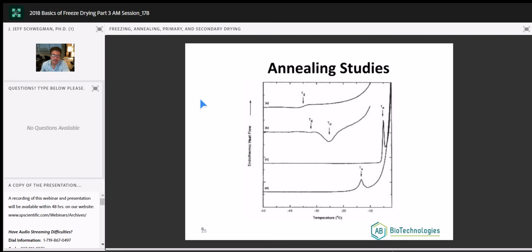On the DSC, if you recall from last time, very classic glass transition temperature, Tg prime. Again, the S-curve. Very classic eutectic melt here. Very sharp symmetric peak. This shows us a metastable system, okay? How do I know that? Well, I see a small Tg prime.